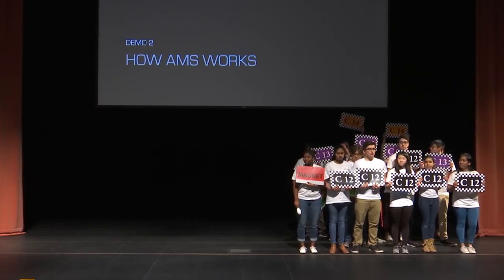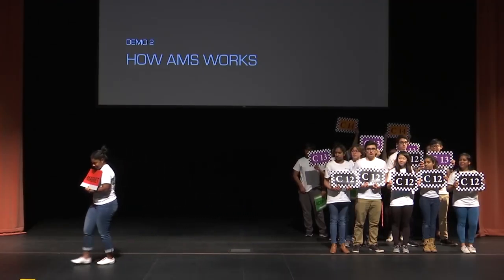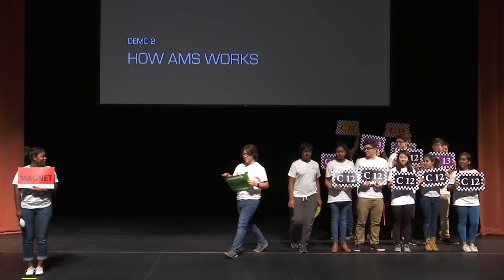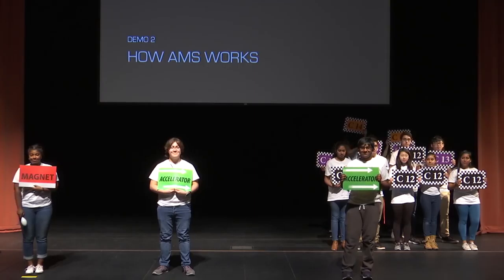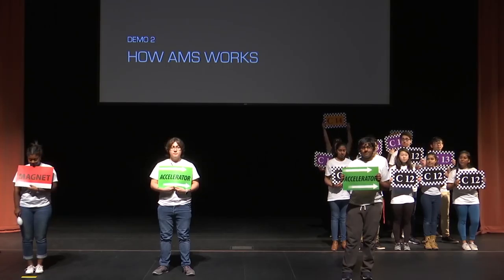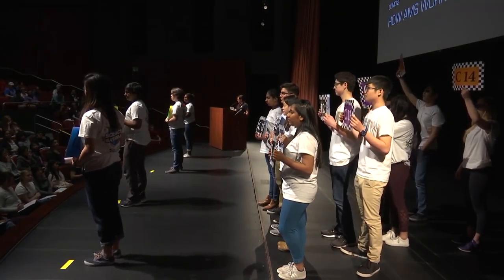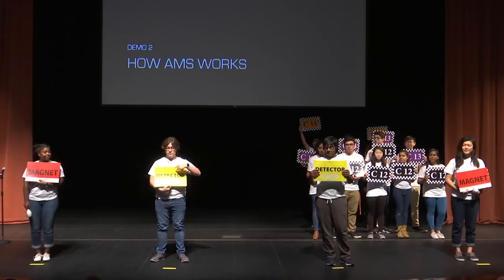First, I'd like to introduce the C12 magnet. Her job is to make sure that the C12 carbon atoms are placed inside the collection cup. Right next to the C12 magnet, we have the accelerator. The accelerator acts as a super awesome car wash, strips down the ions, and the C13 and C14 ions move as if at 1/10 the speed of light. And then next to the accelerator, we have our C13 magnet. The C13 magnet's job is to collect all the C13 atoms. And then finally, we have our detector. The detector will detect C14.